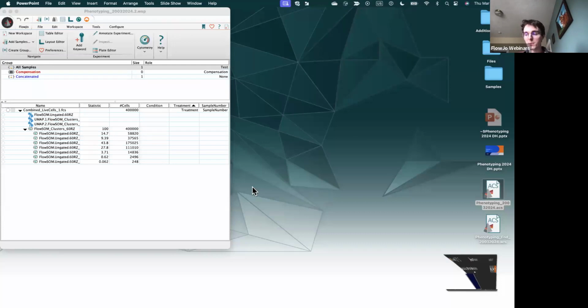So at the moment, we haven't found a great tool to automatically identify the phenotypes of flow clusters, though we've definitely looked at quite a few tools that get close. But for the process today, it's going to be up to us to name the clusters based on our knowledge of the biological background. But we can get a quick idea of what the expression is, and that's going to help us a lot for identifying what these clusters are. Okay, so I think I answered the question.